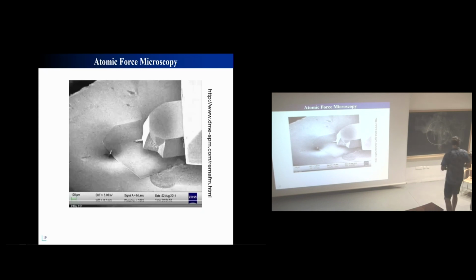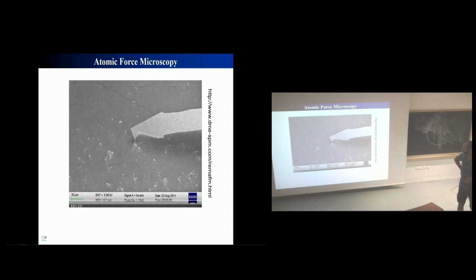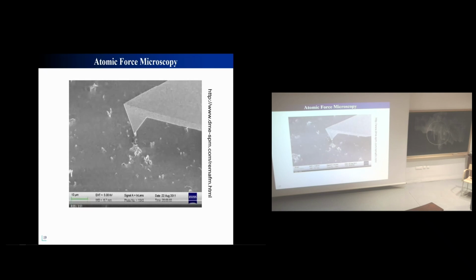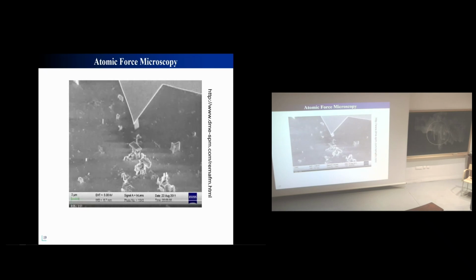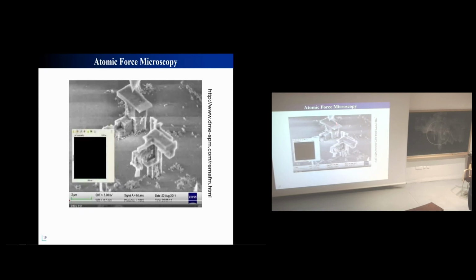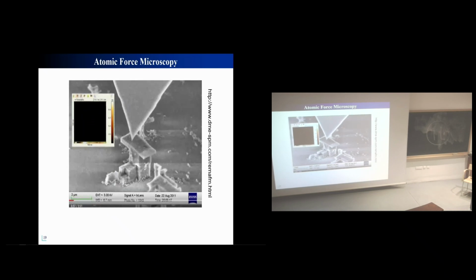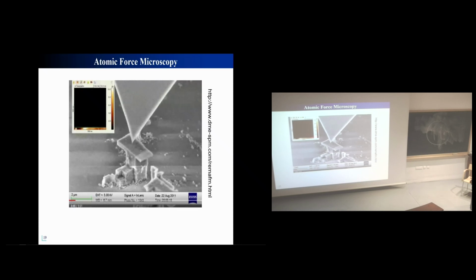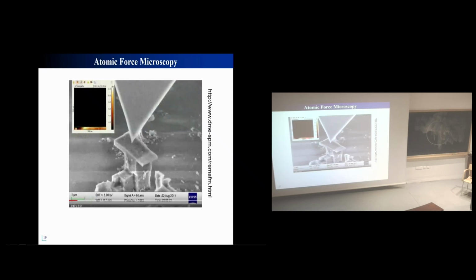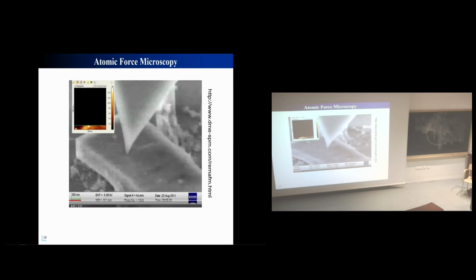Okay, a small movie. I like movies. This is a real scanning electron microscopy observation of a working AFM. Note how big this stuff is: the probe and the cantilever compared to what you want to measure. So the tip is engaged, and the small fingers start to scan the surface, and the surface is reconstructed line by line, slowly.